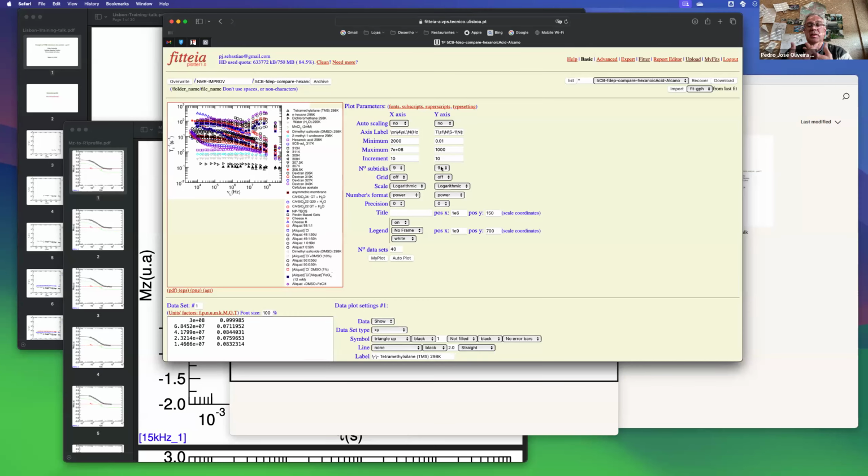If we are in the presence of a bi-exponential decay, it means we have two T1s, and we have probably a mixing factor between these two exponential contributions.